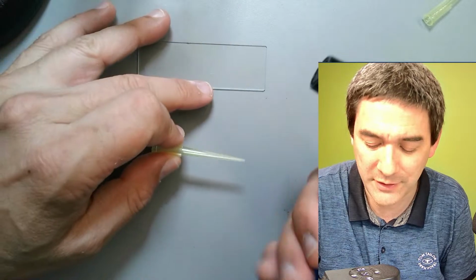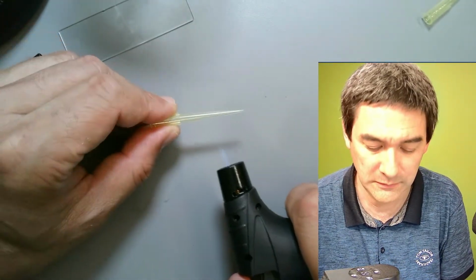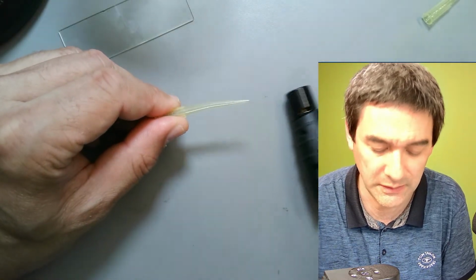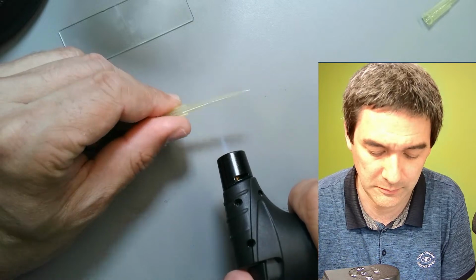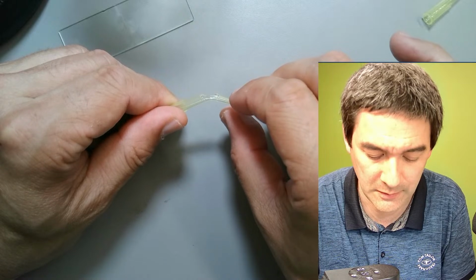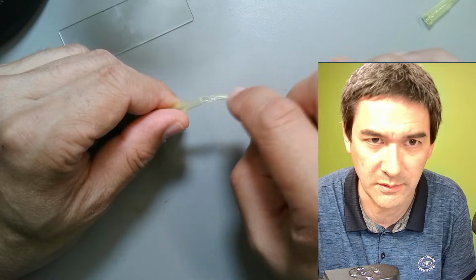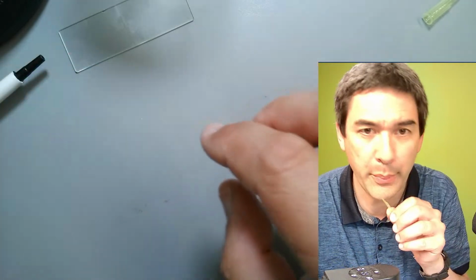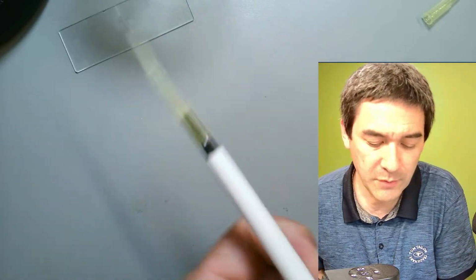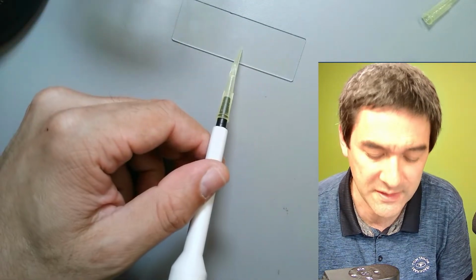Yeah, I've got a lighter here. I've got to be careful that the heat doesn't damage the camera. I melt it. I bend it down. A little bit more maybe. I bend it down. You just have to make sure that you don't burn a hole into it. And then when you put it on here, it's much easier. It's much easier for you to actually pick up samples this way.